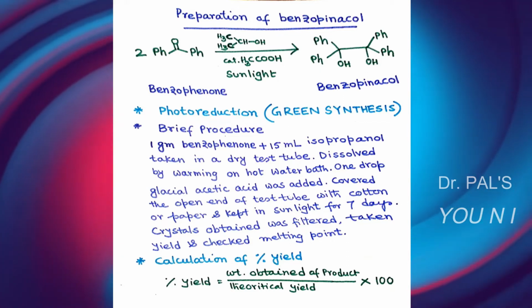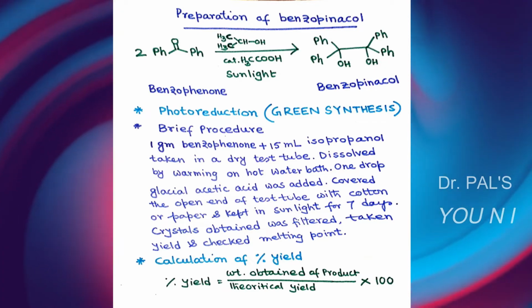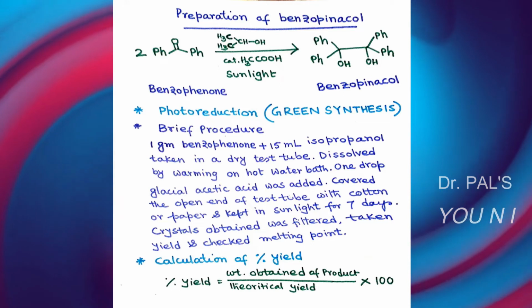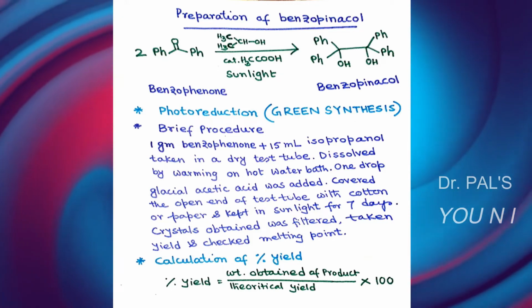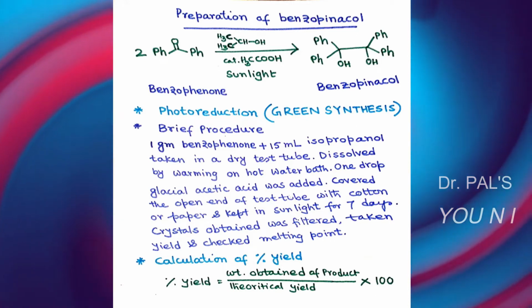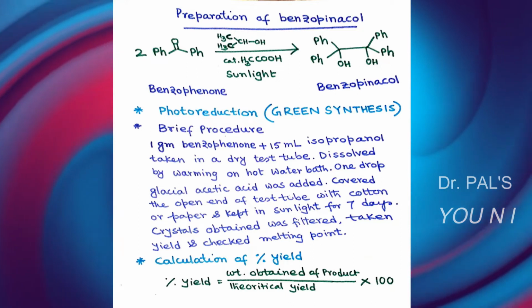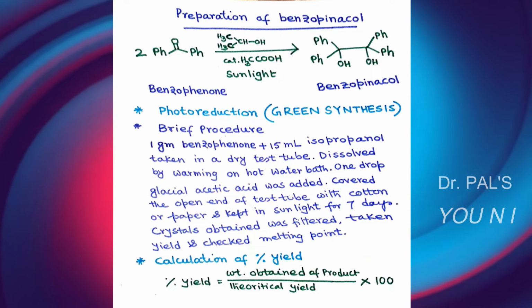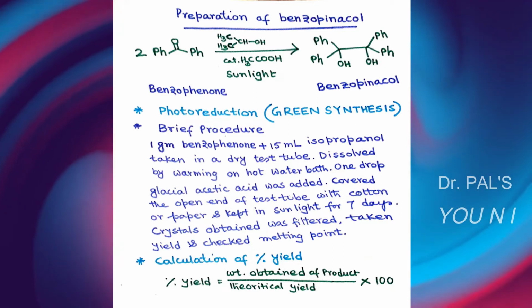During these 7 days, we will be able to see the crystals of benzopinacol growing, and if we check the TLC, depending on the progress of the reaction, we can filter that solid benzopinacol. This benzopinacol is pure enough that recrystallization is not required. After drying this product, we can take the yield, and the melting point can also be checked.